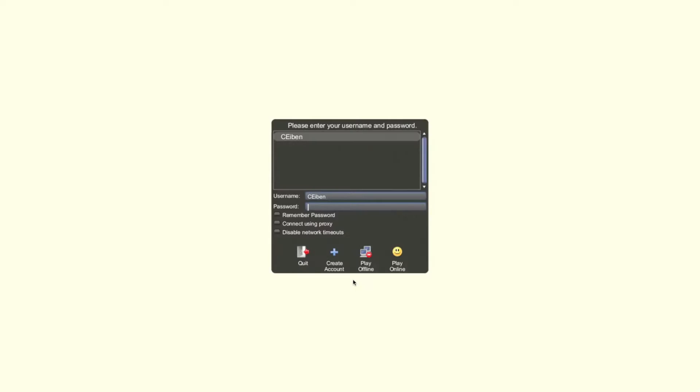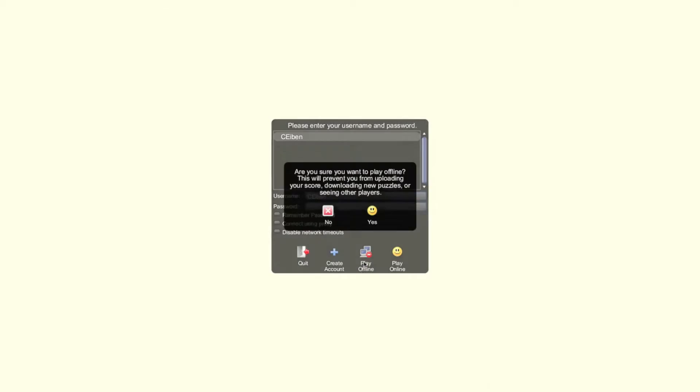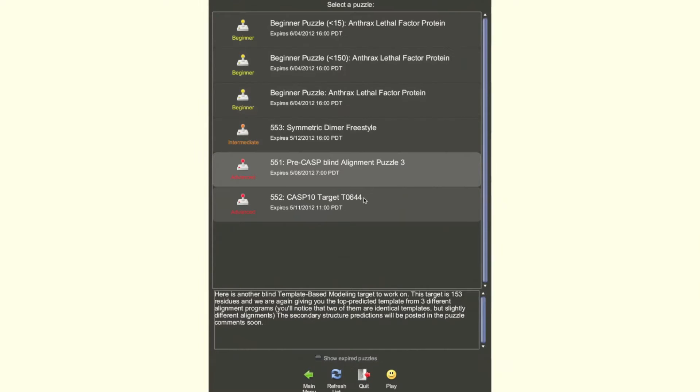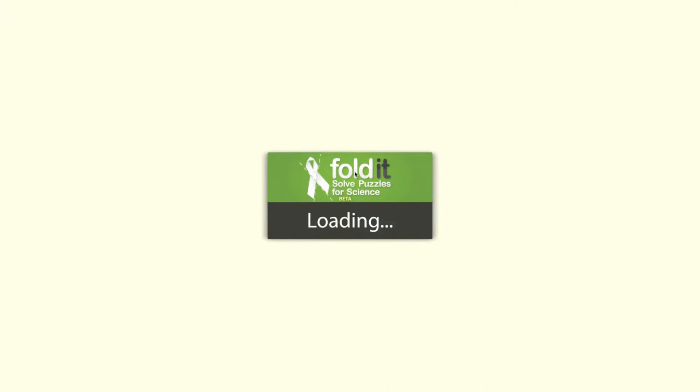Hi, I'm Chris from the Baker Lab, and today I would like to give an introduction to the alignment tool. The alignment tool is a powerful way to align structures and make decisions that automated methods frequently struggle with.